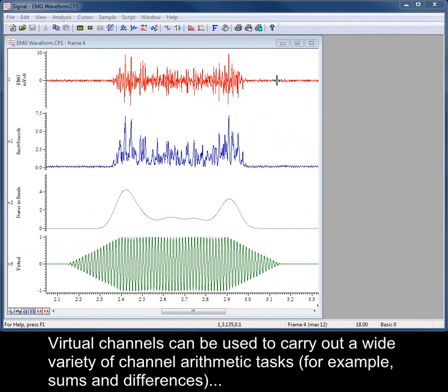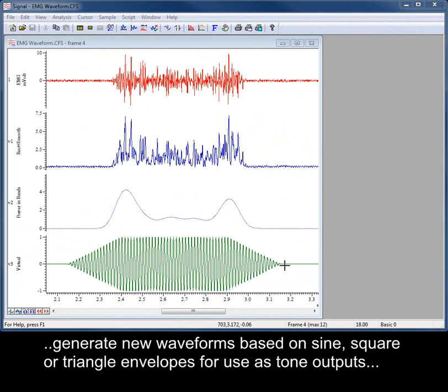Virtual channels can be used to carry out a wide variety of channel arithmetic tasks, for example, sums and differences, generate new waveforms based on sine, square or triangle envelopes for use as tone outputs.